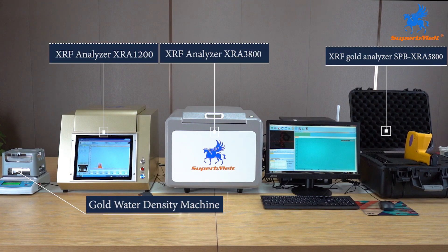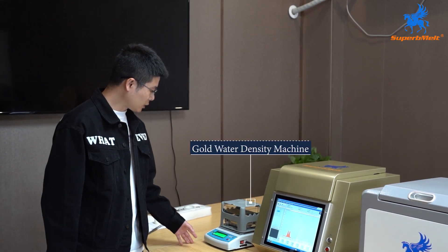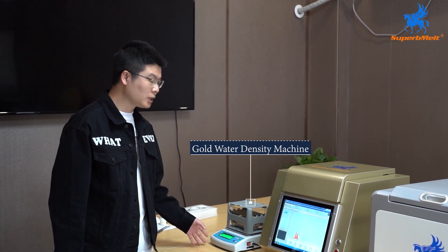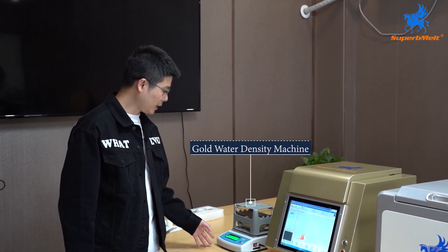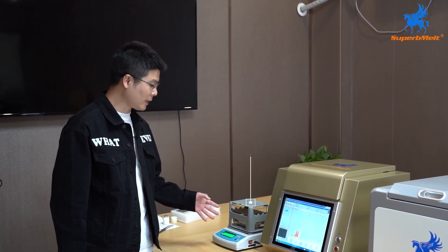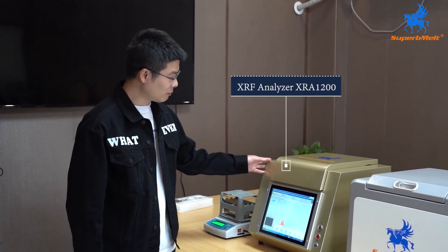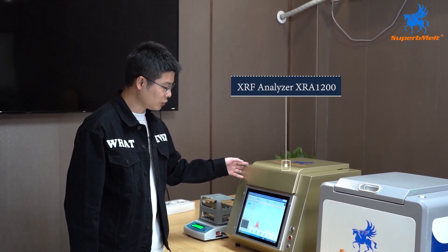Let us introduce the Superb Melt XRF analyzer series. There are different features to meet customers' application requirements. The gold water density machine is a fast, high accuracy, and automatic identification machine — it can identify precious metals' density in five seconds to determine purity. The Superb Melt XRF analyzer XRA 1200 features an all-in-one design.